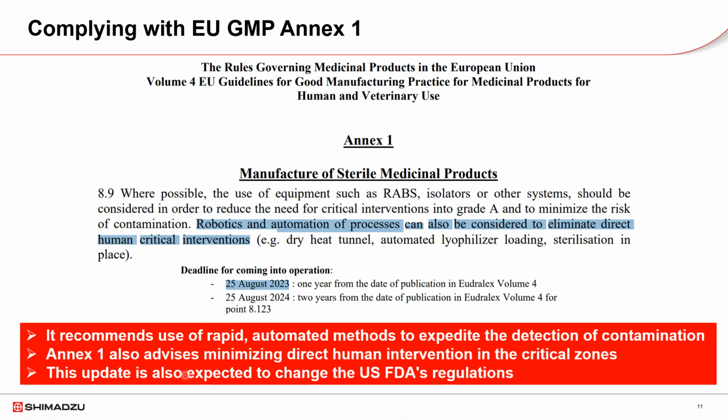This update is also expected to change the US FDA regulations, and this update is the latest to be implemented from 2023 itself. Overall, online TOC could help to meet such requirements of automation and avoiding human intervention in the plant.